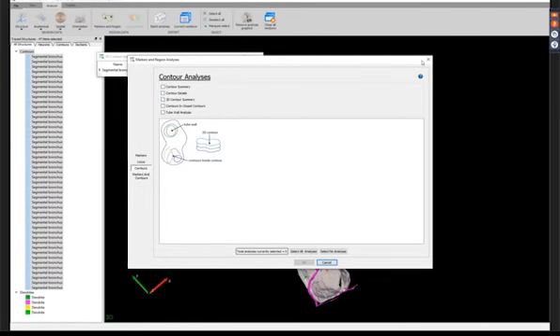And we can also do things like layer length analysis, where you define multiple open contours, and the metrics that are provided for that is the length of the fibers that cross through those open delineations or those layers themselves. So there are a few analyses that you can do with open contours.